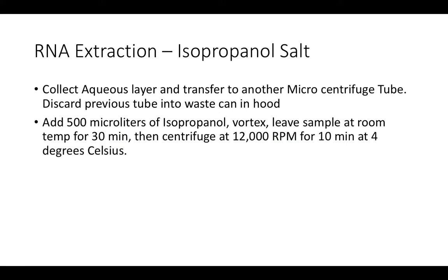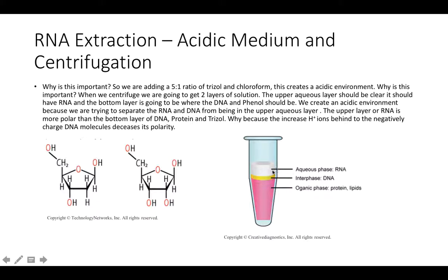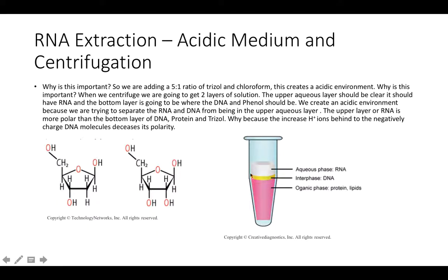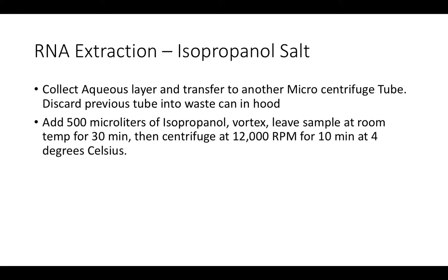Next step is to collect the aqueous layer we just separated from the centrifuge and transfer to another microcentrifuge tube. We're going to discard the previous tube into the waste can in the hood. We discard it because it contains Trizol, and if we're using Trizol, it's always going to be in the hood, so you can't put a hood chemical in regular garbage. You have to put it in the hood can, or whatever you call it.